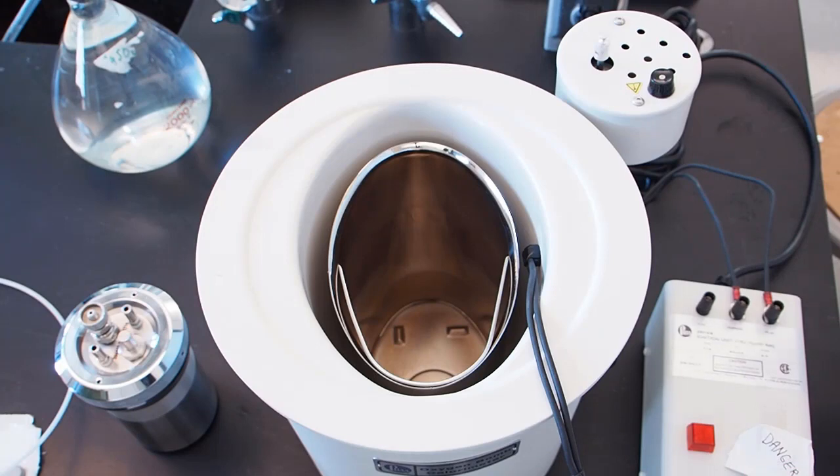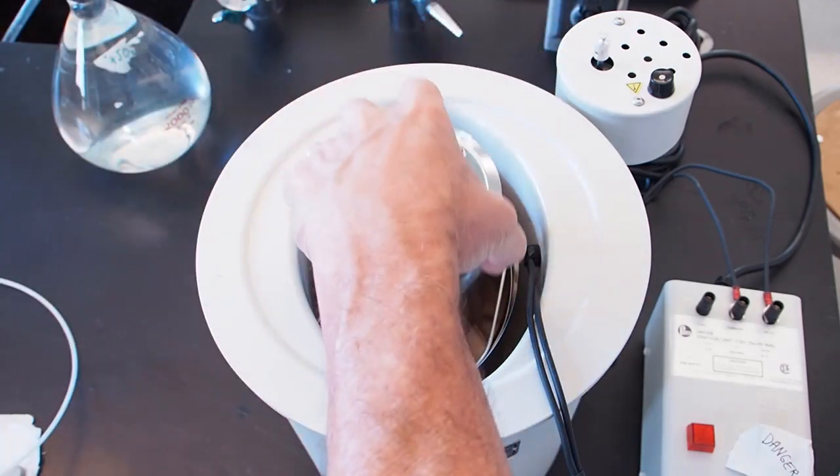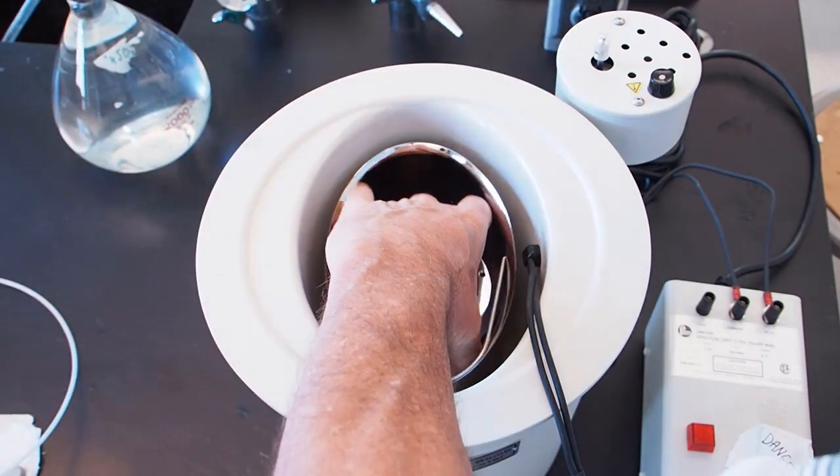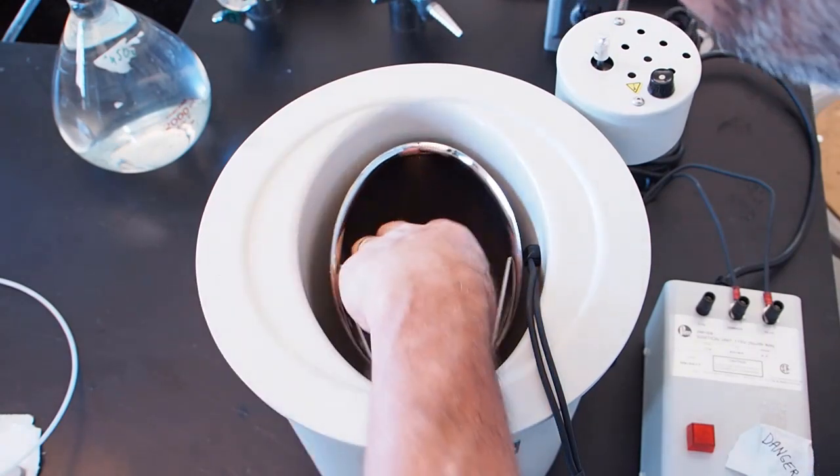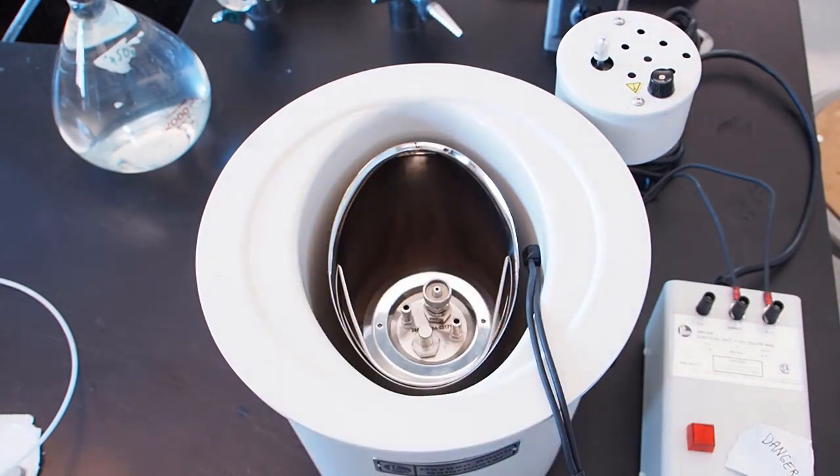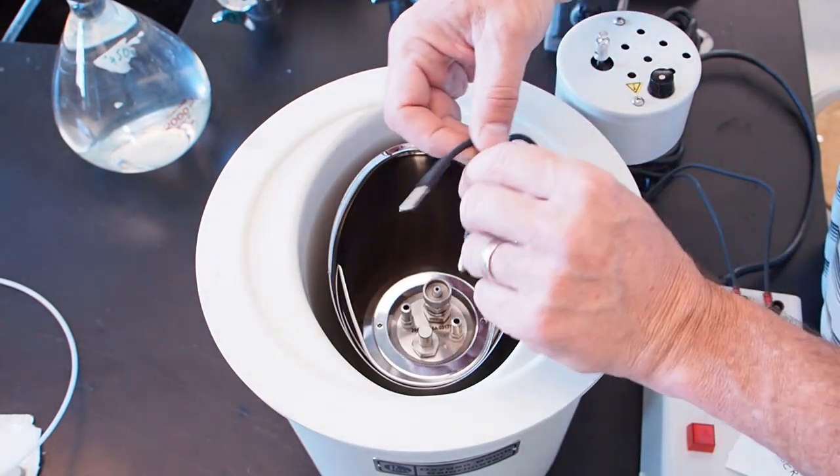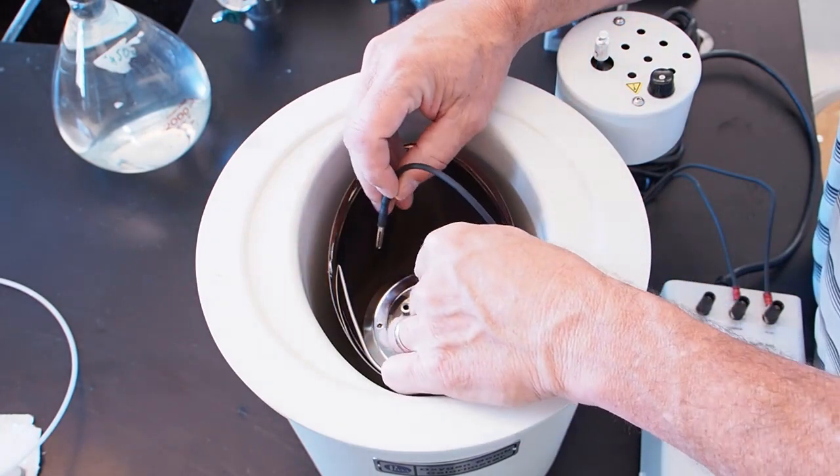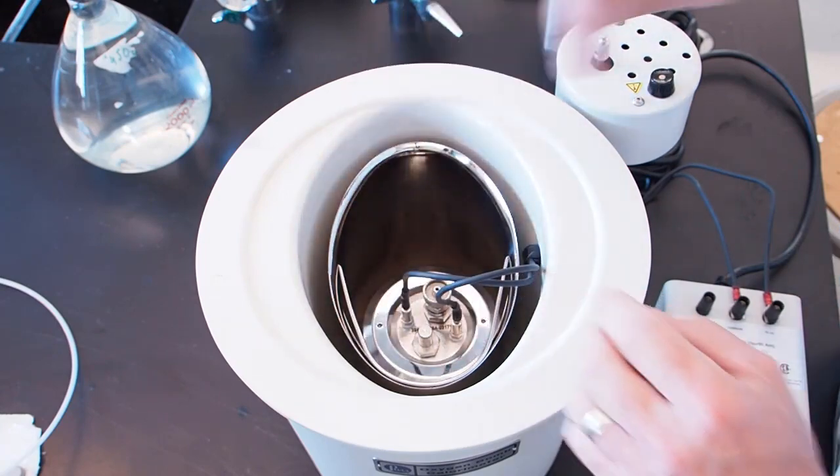Okay, so now we're going to assemble the whole system. So we're going to take our bomb, which has our sample and the oxygen in it now, and that goes right in the middle here. And then it sits snugly there. And then what's going to happen is we're going to first connect the two leads that are the electrical leads that are going to be used for igniting the wire, the ignition wire, which will then ignite the dog food.